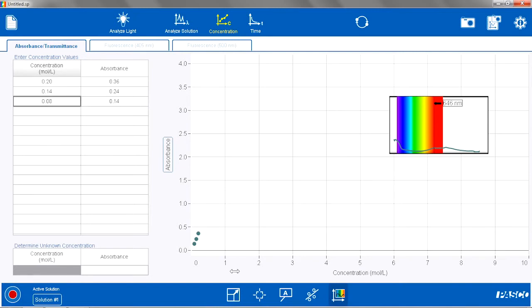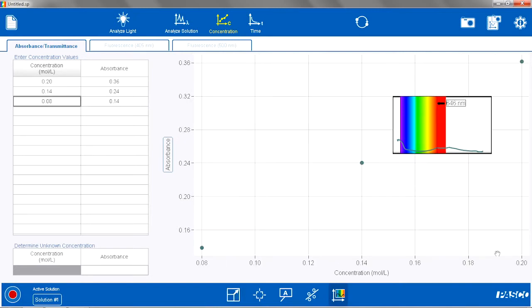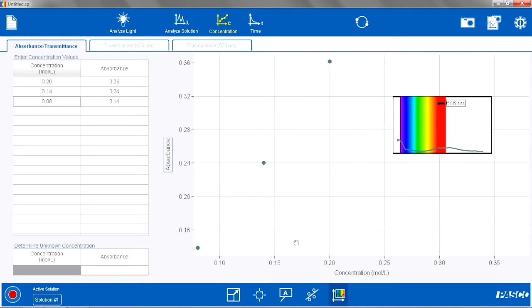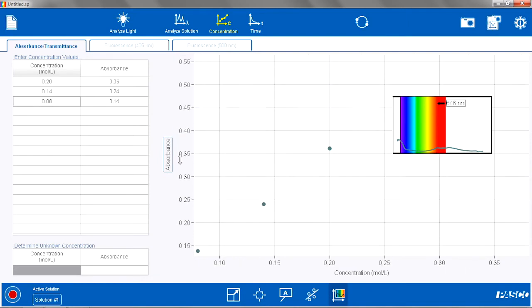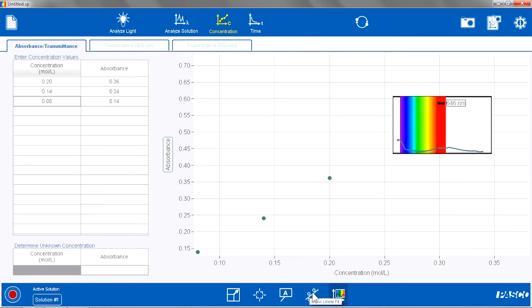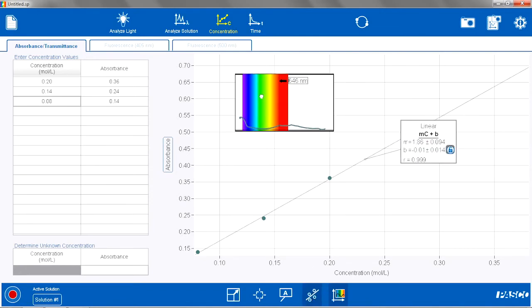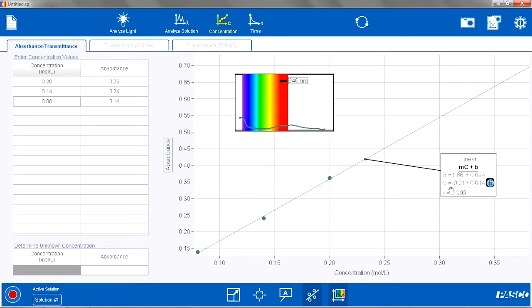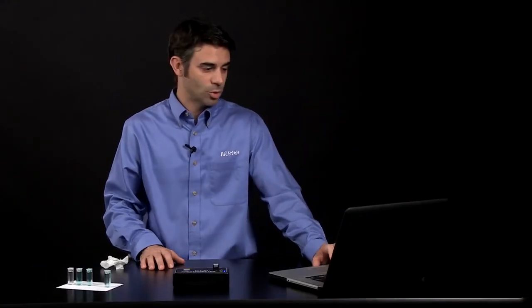I can see my points down here. I can autoscale that graph and see those points line up. I am going to rescale it a little bit so we can see the graph and the full spectrum better, and I am going to apply a linear fit to that. Using the tools down here, I am going to show a linear fit. I can see my linear fit with the slope, the intercept, and the R value of 0.999 — a pretty good fit for those concentration and absorbance values.